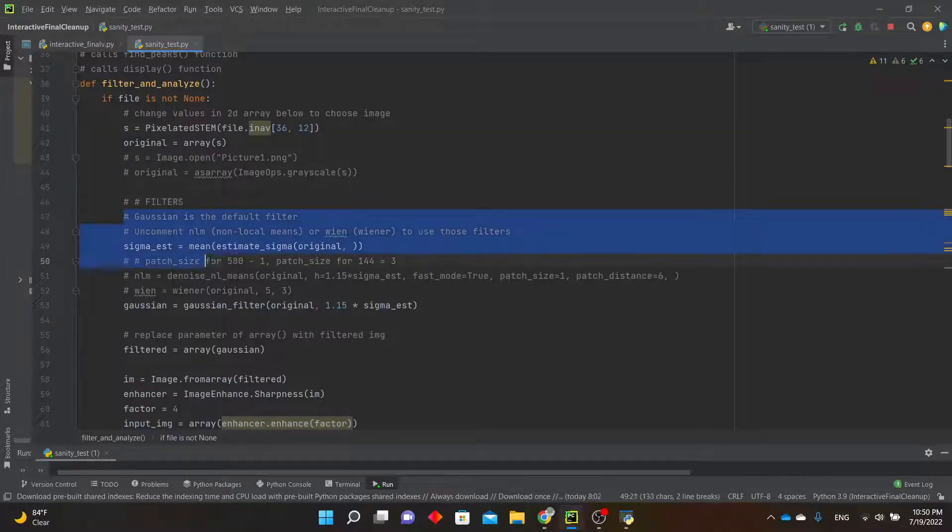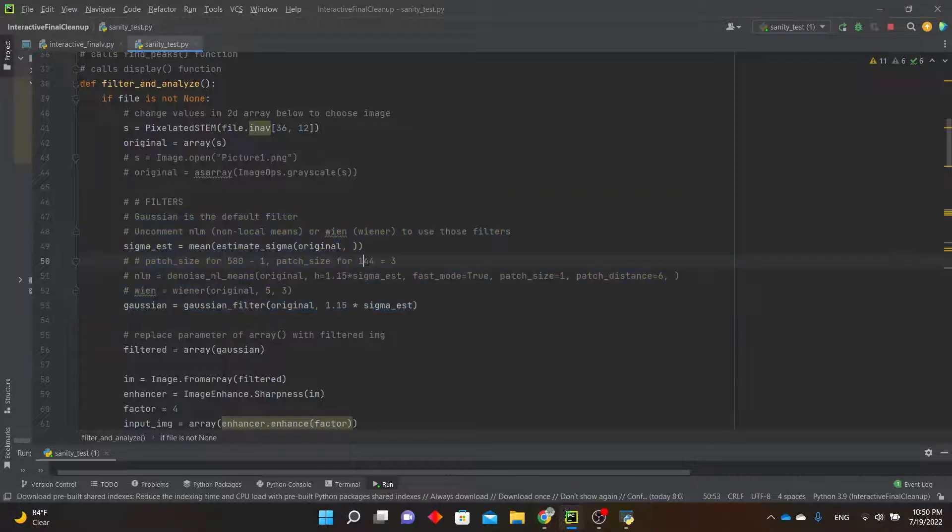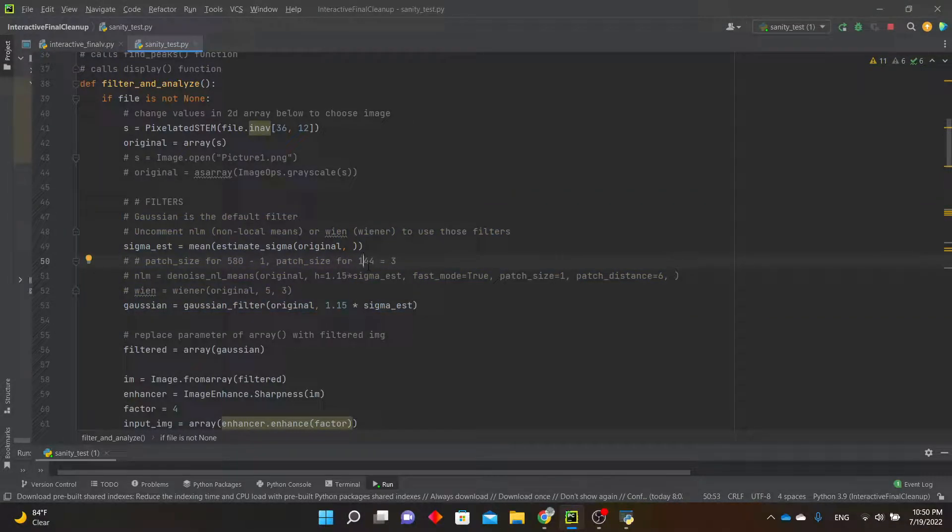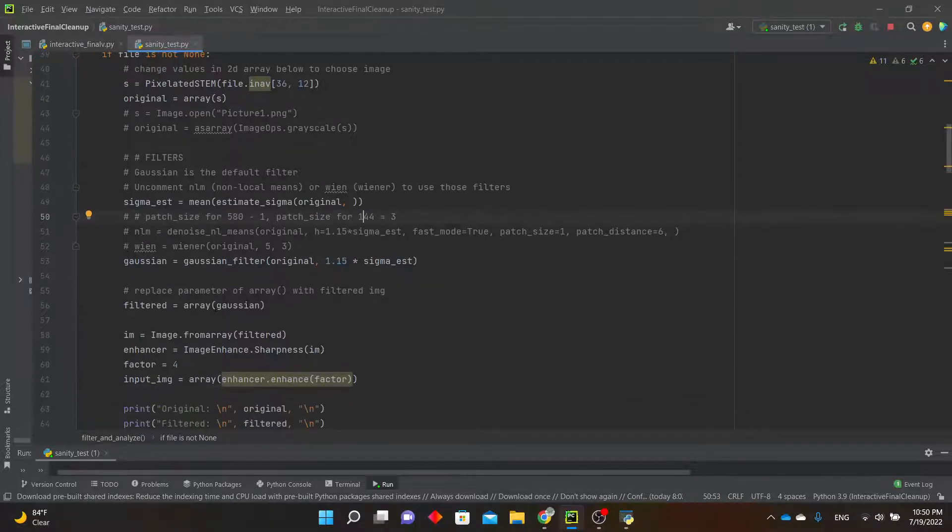Three different filters are available in this block: Gaussian, which is the default, non-local means, and Wiener. You can uncomment the one you want to use and comment out the others, and just replace the variable name here.